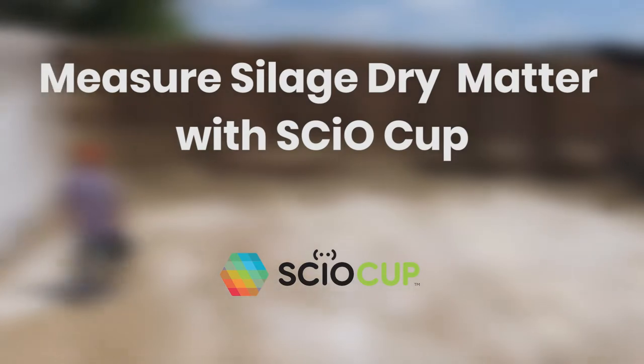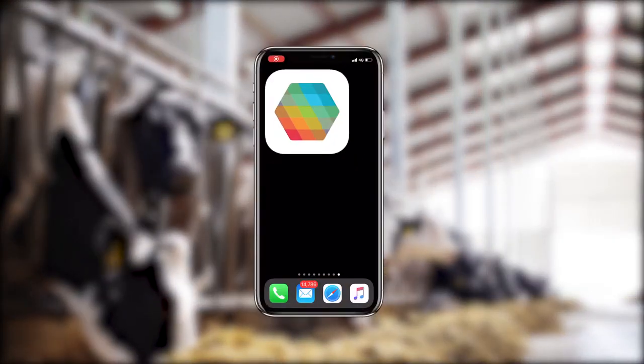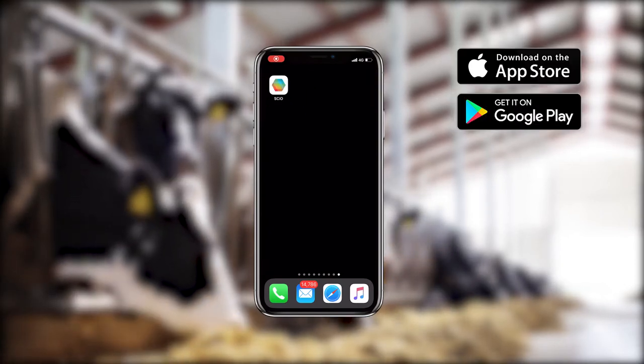This video will show you how to properly measure silage dry matter with Siocup. First, make sure you have the app installed on your phone. Download it from the App Store for iPhones or Google Play for Android phones.